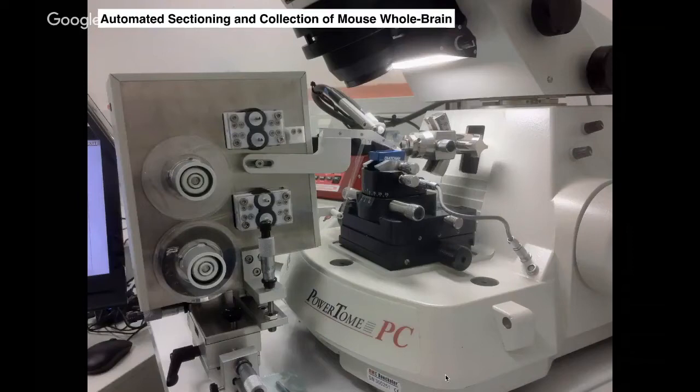Now, when I first attempted this, I explained to the people selling me these machines and other ultramicrotomists what I was intending to use their machines for. And the old school ultramicrotomists were just giving me warnings that something terrible would happen if I tried to actually cut through a centimeter size sample with these ultramicrotomes. This didn't discourage me at all, but actually got me quite curious to find out what would happen if I seriously attempted this. So of course I went ahead and did this.